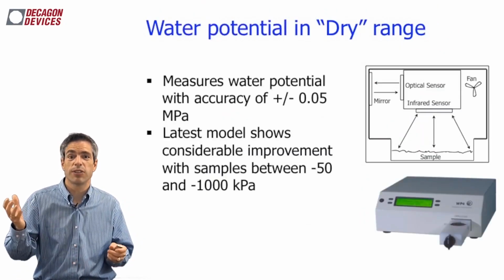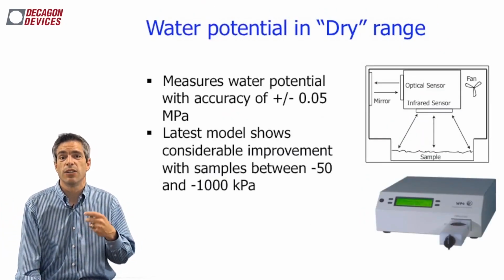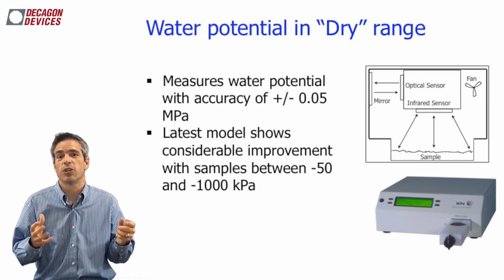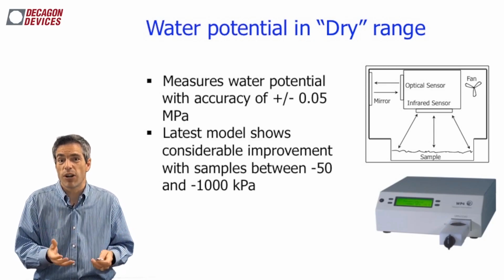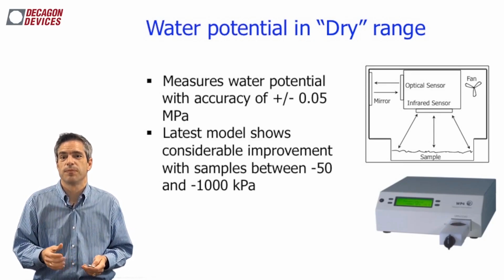What do you do for dry soils? Well, this is our old friend. We've already talked about it, the dew point potentiometer that we collect the dry side water potential in. But notice I didn't say water content. What do we do from that?